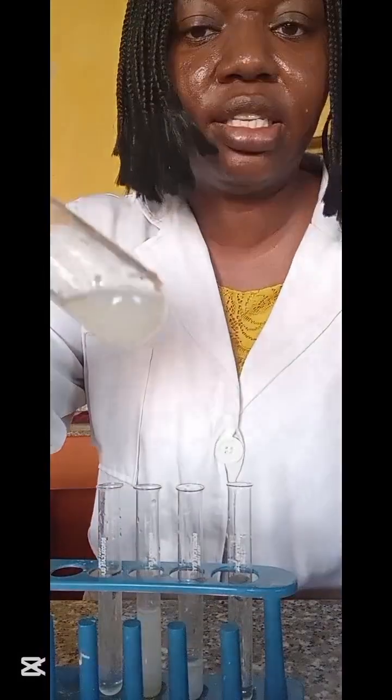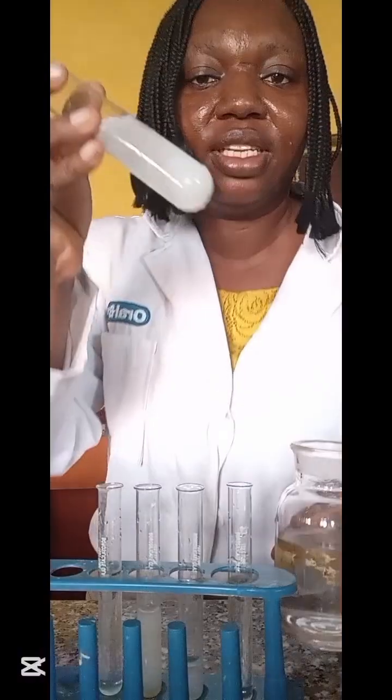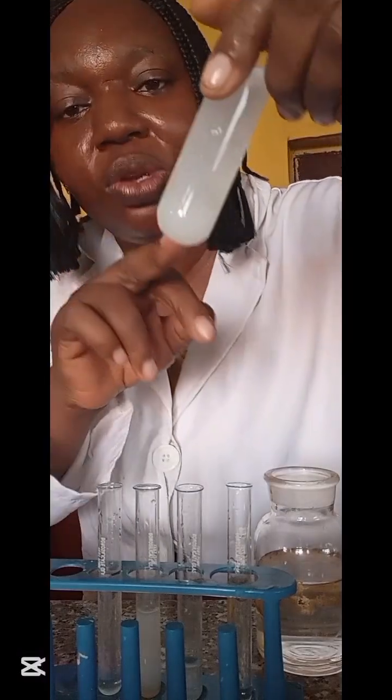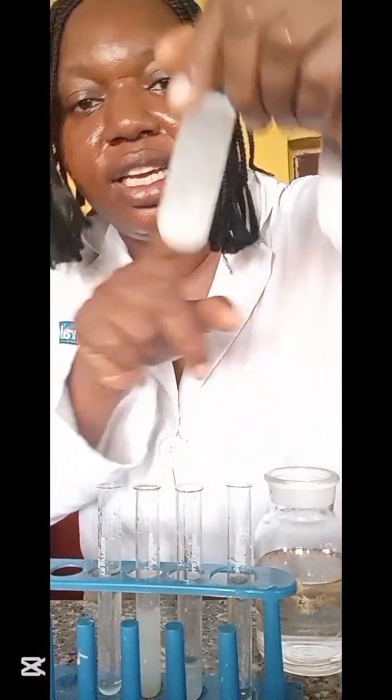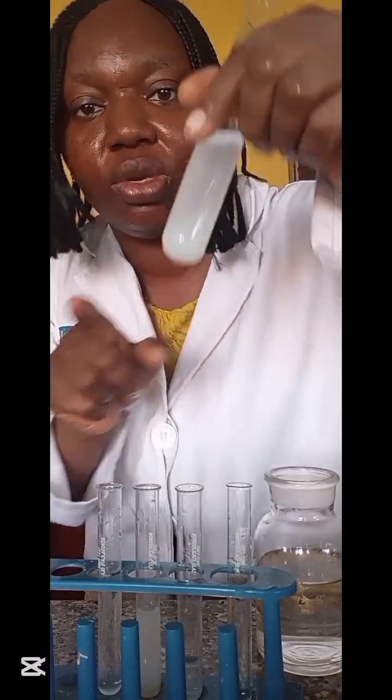With ammonia, in drops, gelatinous. In excess, you see, it became more cloudy. It did not dissolve. No matter how much you shake it will not dissolve, and it will settle. Instead of clearing up, it will become thick and settle. That's how to know that something does not dissolve. So this is aluminum. It does not dissolve in ammonia, but zinc does.